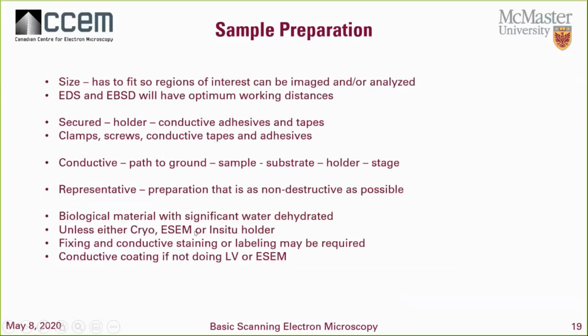So the primary thing when you're doing sample preparation is to know that the sample will actually fit in the microscope. We have had cases where people have brought samples which are too large to fit in the SEM, so you may have to cut them down to size. You also have to consider what sort of work you're going to be doing in the SEM, so you may have to size them down to an optimum so that you can do the analysis or the imaging you want to do, depending on the microscope you're using. Microscopes have different size chambers, so it's important ahead of time to consider this.